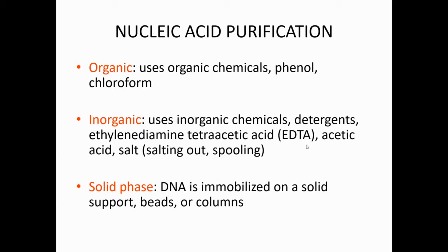This step involves the removal of protein, carbohydrate, lipid, and cell debris. We have different techniques that can be used to remove them, so that you can purify your nucleic acid.